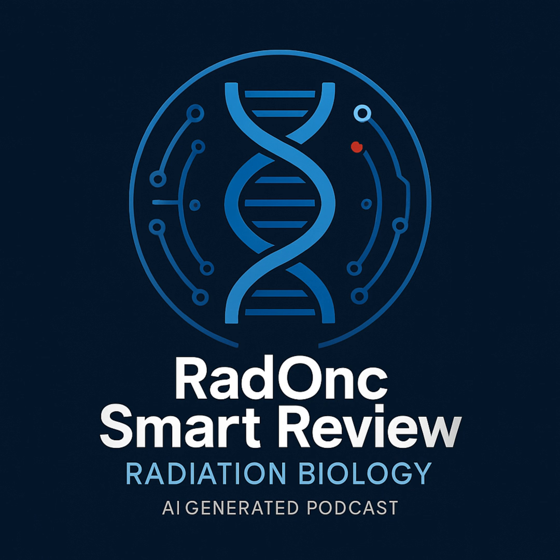Okay, Pearl number 3, gamma H2AX foci. These specifically mark the sites of DNA double-strand breaks. It works by detecting the phosphorylated form of histone H2AX at serine 139 via immunofluorescence. Counting the foci in the nucleus gives you a direct quantification of DSBs and lets you track repair over time. A cornerstone assay in radiobiology.